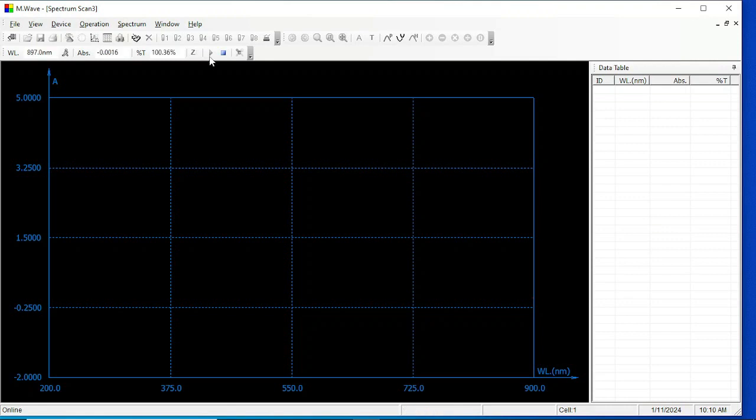Now it has become zero. See, as I make this water the blank, zero calibrate, you should not get any peak. It will be a straight line, right? This will happen the first time. Then I will go for your sample. Then we will see at what wavelength it will give you the peak. At each wavelength, it will record the absorbance in the form of a graph, and you will have these absorbance values over here.